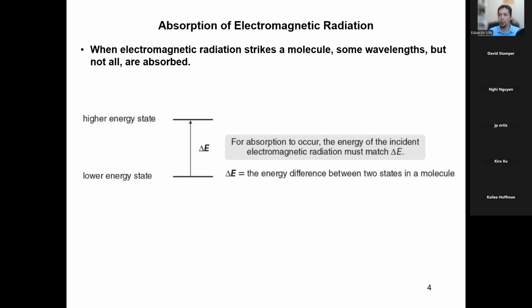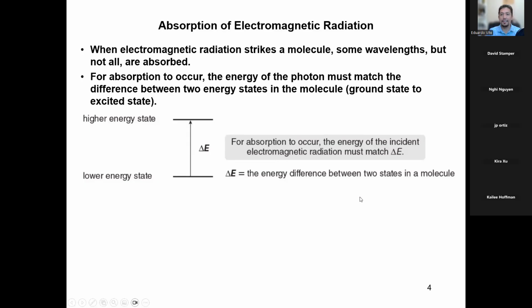You can think of it as food, or like fuel, if you will. But here's the thing: it has to be very specific. You've heard of quantum physics. The reason it's called quantum is because there are very specific energy amounts that systems can occupy.